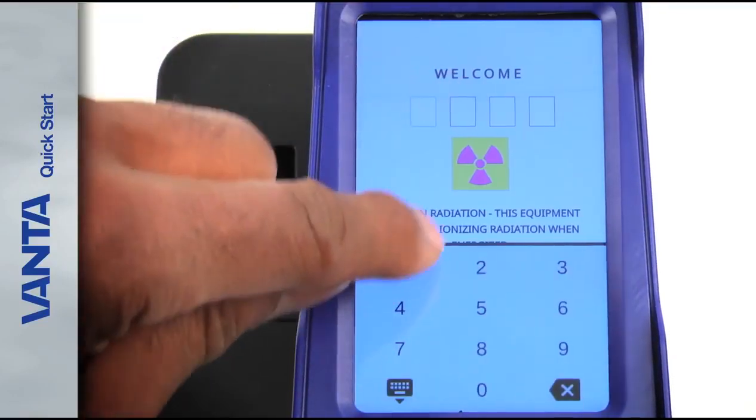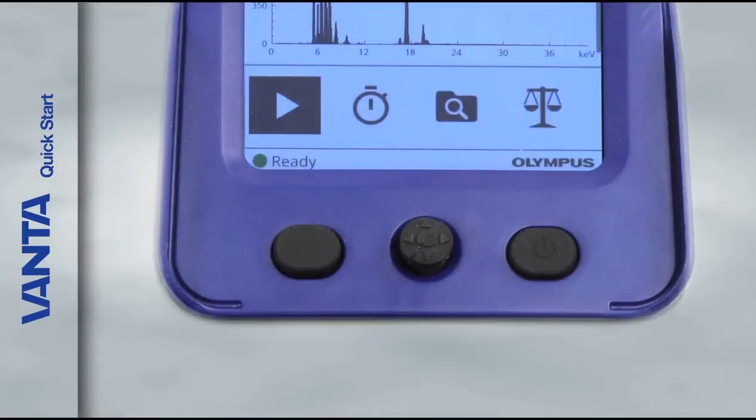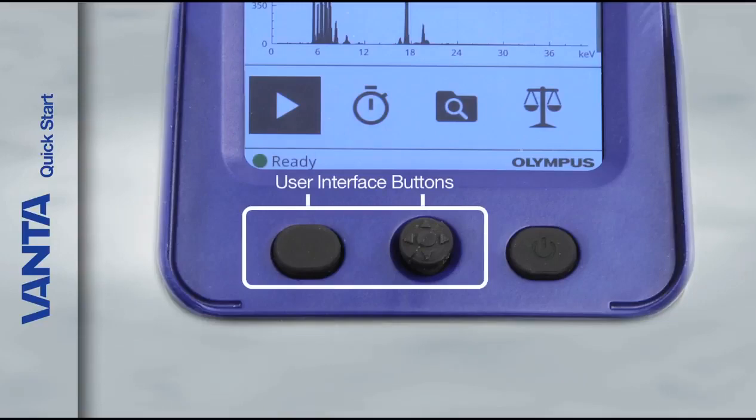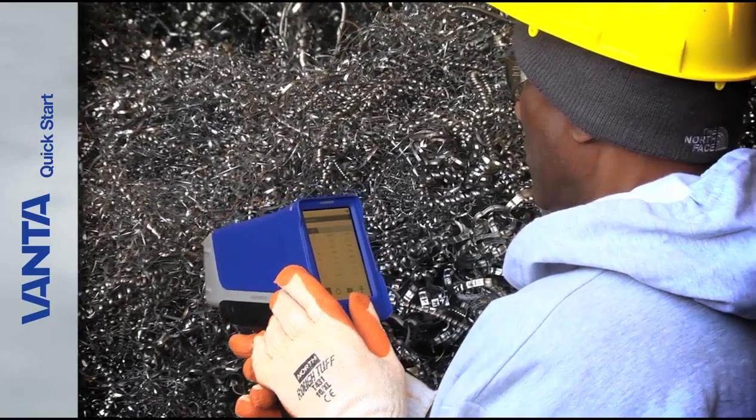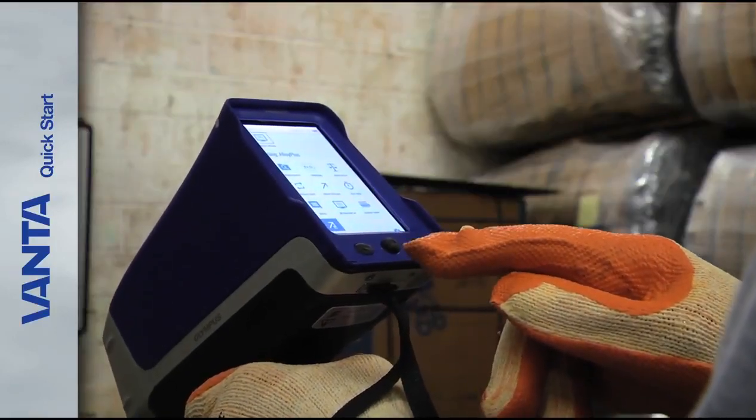After you've read the radiation safety warning, log in. Tap the leftmost box to display the keypad and enter the password. Below the touch screen are three buttons. Two of these buttons are used to control the user interface. These buttons are useful when conditions prevent you from touching the screen, like when you're wearing gloves.